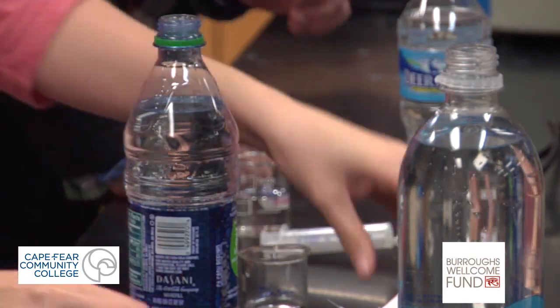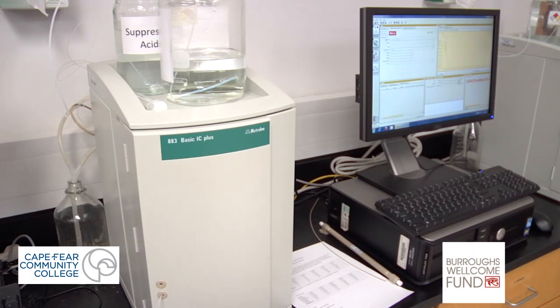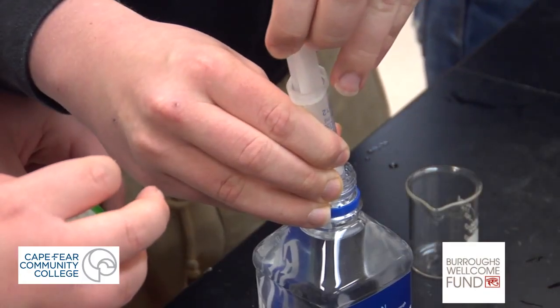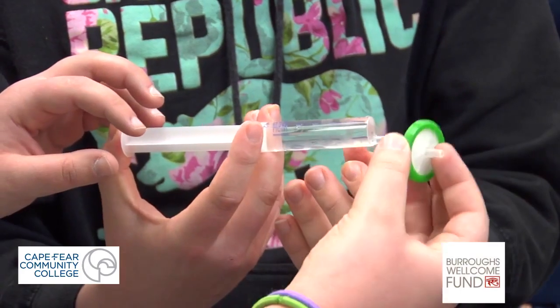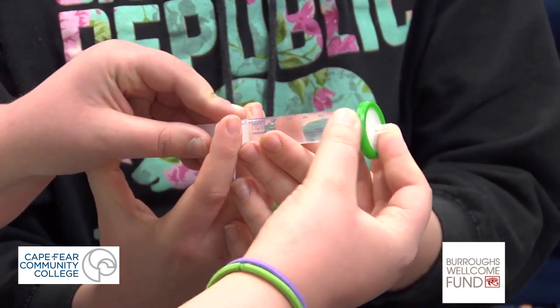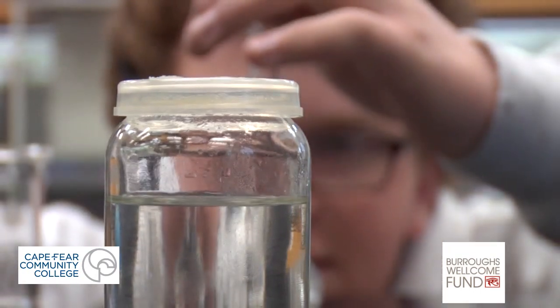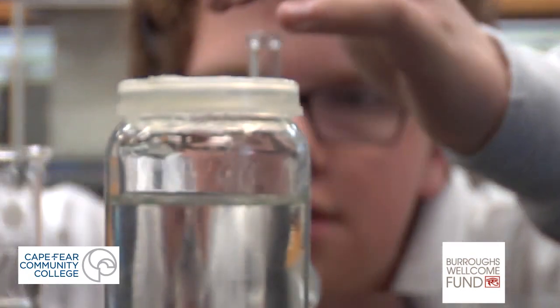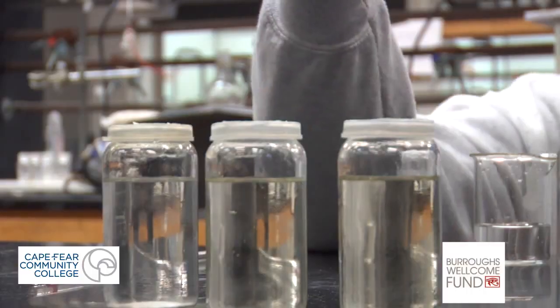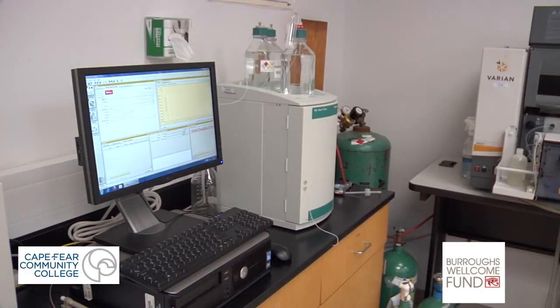First, we collect the water and we're gonna put it in the Metrohm ion chromatograph, and we're gonna get a level as to how much there is of calcium, lithium, magnesium, potassium, sodium, and we're gonna use that level, and it's gonna be like our base. So that's what we're gonna go off of. And then we're gonna start adding just regular water, and we're gonna see how much of the calcium is in there. So we're gonna dilute it. So first, we'll probably put some calcium in a flask, and we'll end up adding the distilled or regular water into it, and we're gonna see what the dilution level is, how much actually could be in a certain amount of fluid, and then we're gonna put those into the Metrohm ion chromatograph, and we're gonna analyze it all and try and match it up.